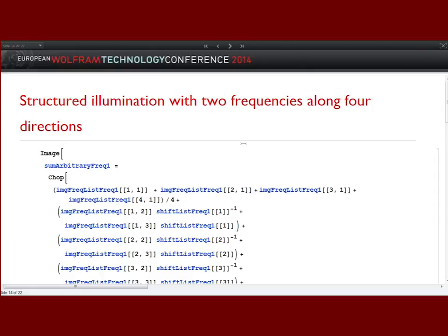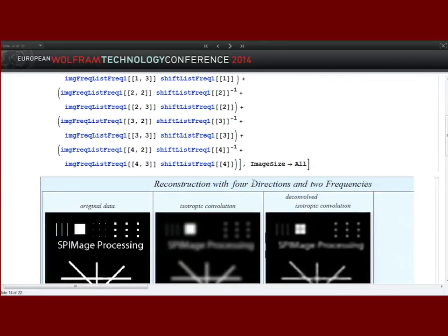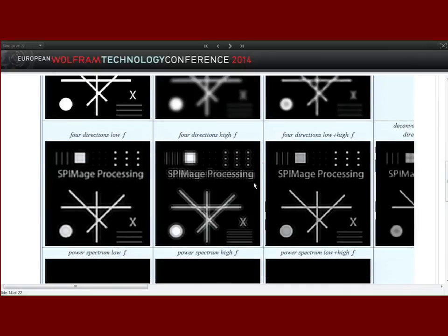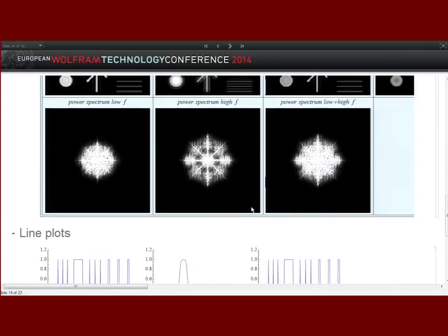And we can go even a step further. And that is really important because with this kind of system that we've generated, we can really generate different frequencies. I'm in the last few minutes, but I don't need much more. And now we're doing it with 2 different frequencies in the whole system. And let me just show this one below. So that is the single view, low frequency. This is the high frequency part.